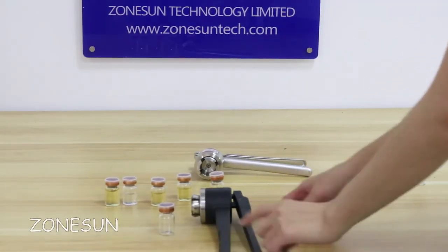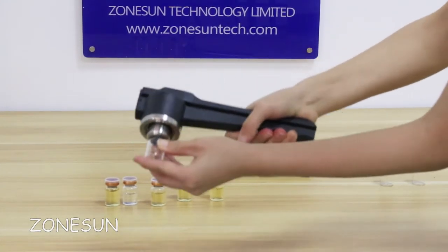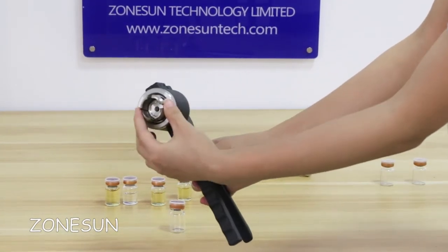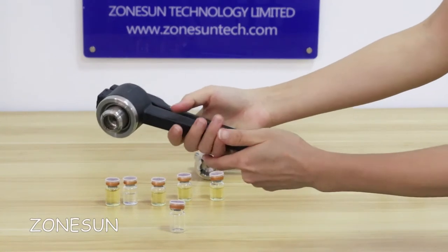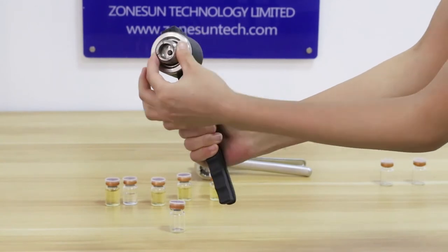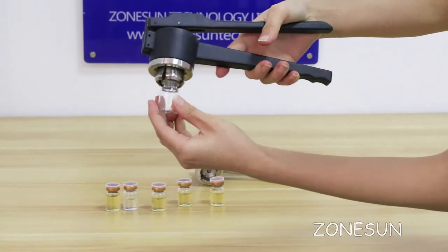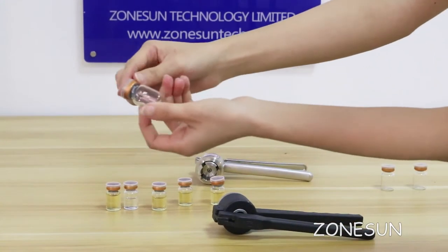When you receive the manual tool, it may face a problem like this. You can do this to fix it — it requires you to adjust the wrapper head. First, press the tool, then rotate the head anti-clockwise. Now you can adjust it and it is perfect.